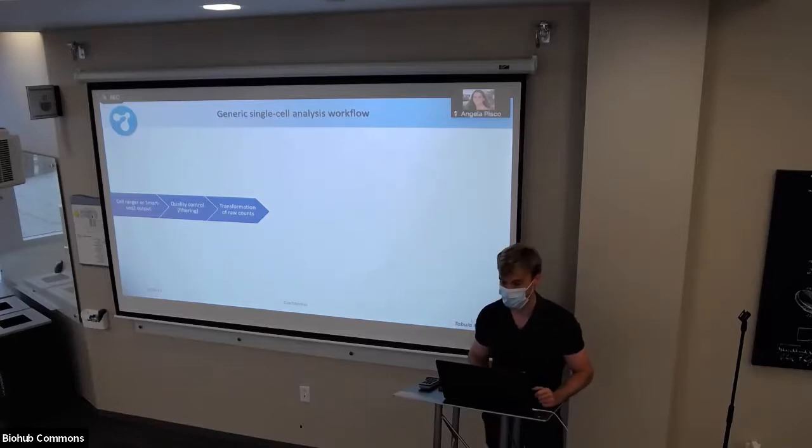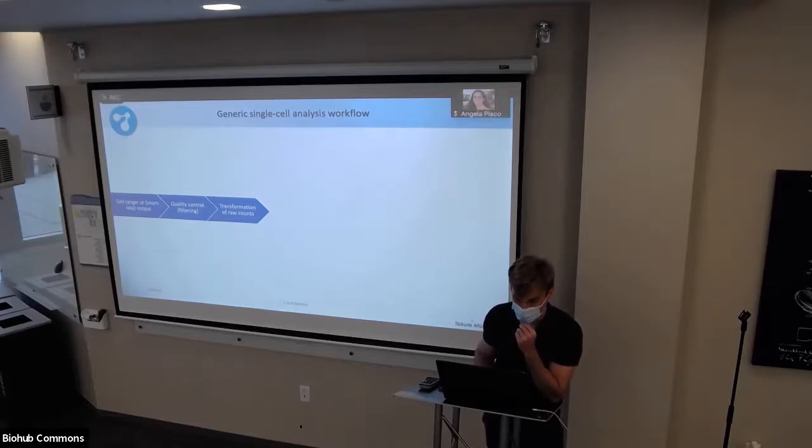Yeah, Sandy. Sorry, Alex. That filtering of housekeeping genes, there are often splice variants of those housekeeping genes that tell you something funky.